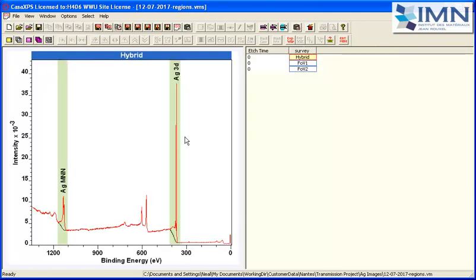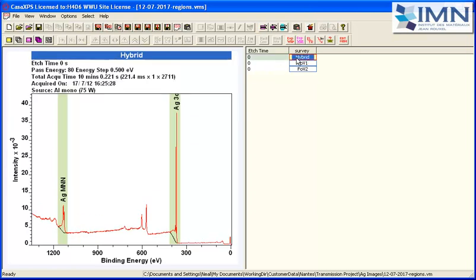And we can look at this again using another imaging instrument. This is a slightly different one. And this one has what is referred to as a hybrid mode. And in hybrid mode, the intensity has been set up not for imaging, it's been set up for spectroscopy counts. So I've got two imaging modes, and these all three have been used to measure a silver spectrum.